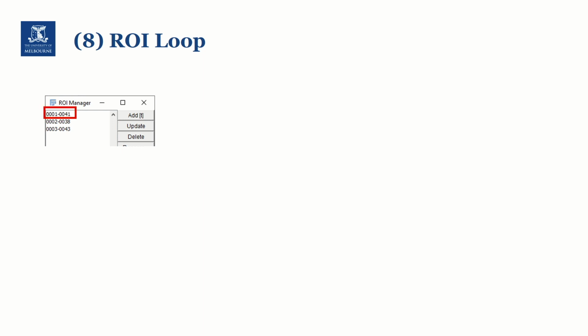When we click an ROI from our ROI Manager, this will create a selection on any active image window. This is the same as the selection created by drawing tools, but just generated automatically via Analyze Particles.